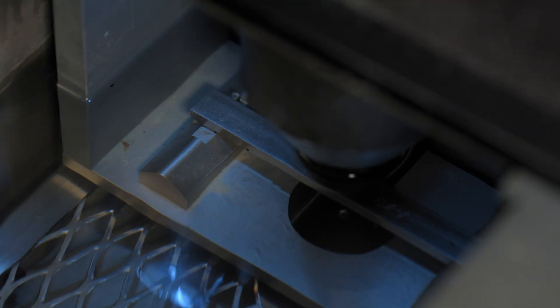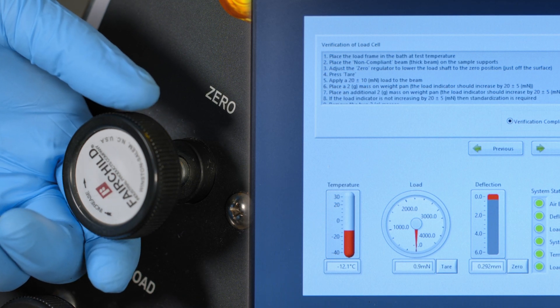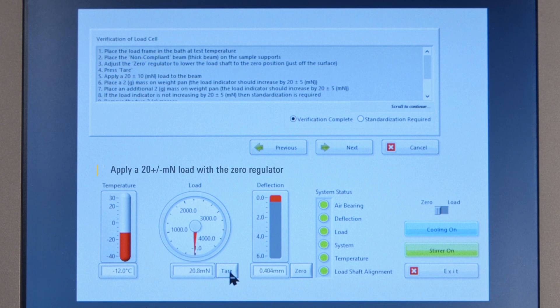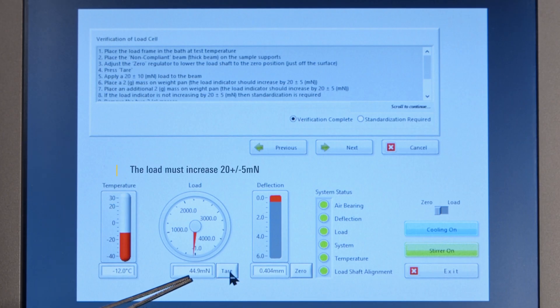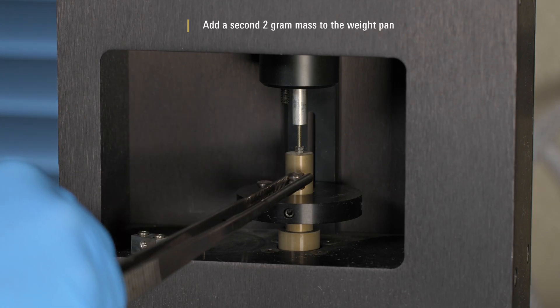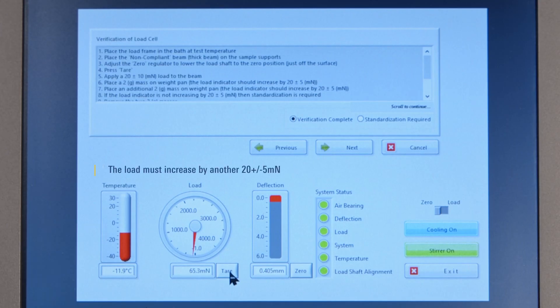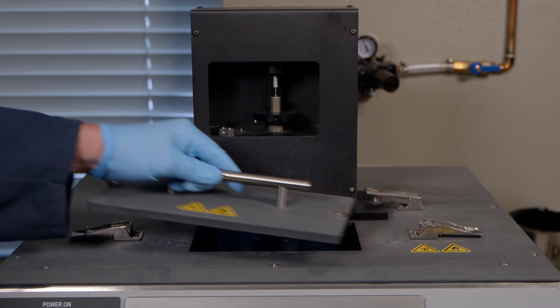Verify the contact load. Place the thick steel beam on the supports. Use the zero regulator to place the load nose just off of the surface of the beam and tear the readout. Apply a 20 plus or minus 10 mN load with the zero regulator. Add a 2 gram mass to the weight pan; the load must increase 20 plus or minus 5 mN. Add a second 2 gram mass to the weight pan; the load must increase by another 20 plus or minus 5 mN. Remove the 2 gram masses and thick steel beam.